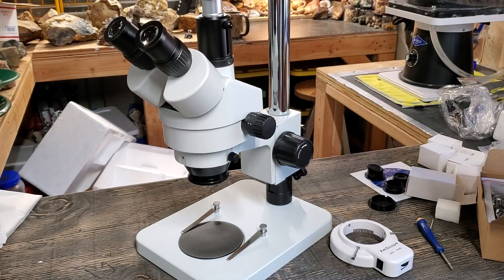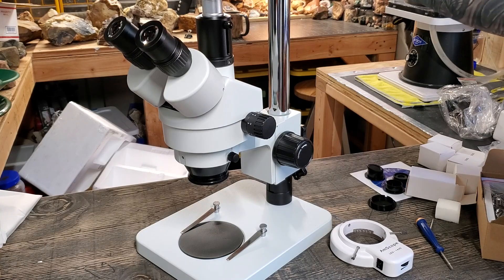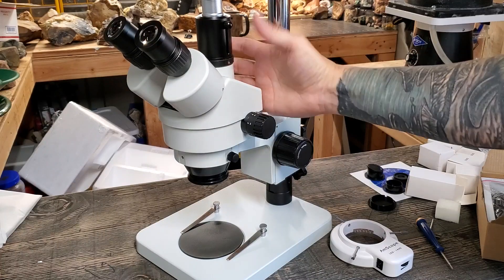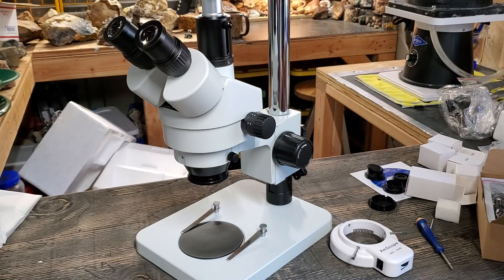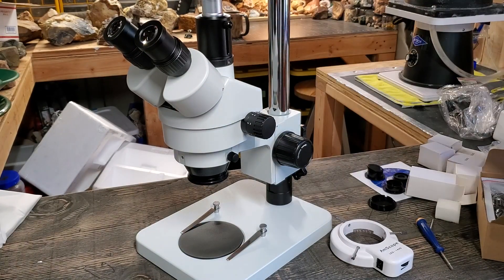This is awesome. We have a camera up top so I can share with you what I'm looking at. A microscope is a key tool in mineral identification and rock identification — it's not something I've had the luxury of having before. The whole world of owning a microscope is all new to me. And a precision tool like this does not belong in a hot, cold, dusty environment like my shop.